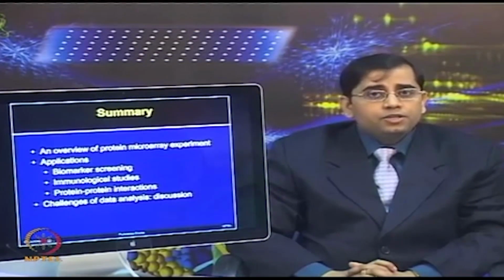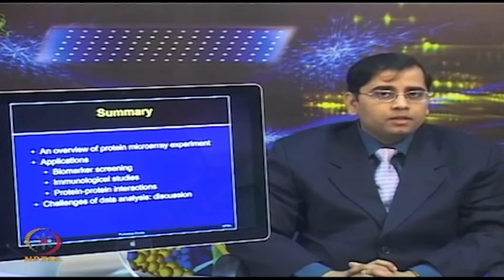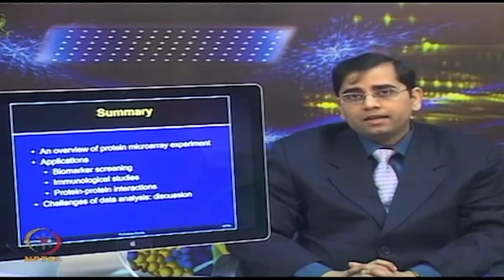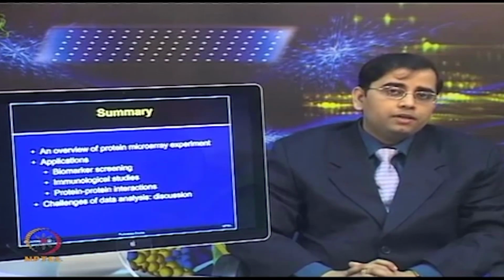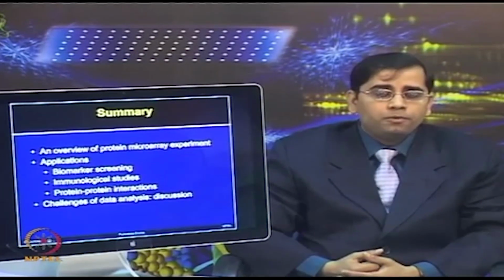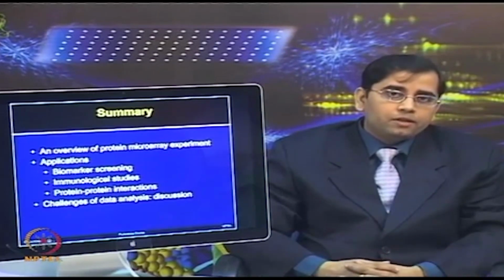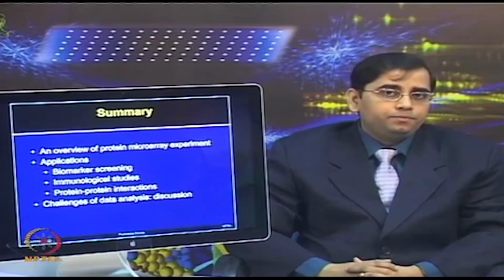However, the traditional cell based approaches have certain limitations. Therefore, cell-free expression based protein microarrays have emerged, and it has been strongly shown that various applications can be performed without the need to purify the proteins, because you can generate the protein content in a cell-free manner.